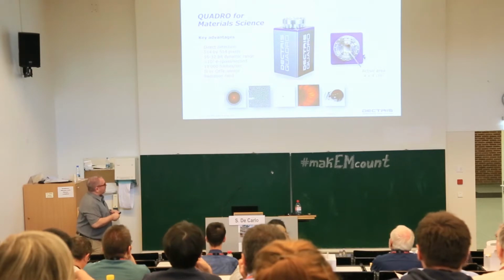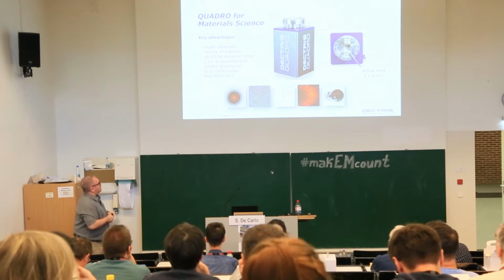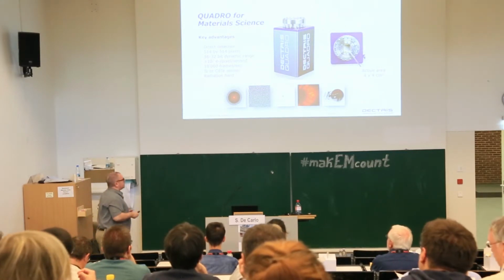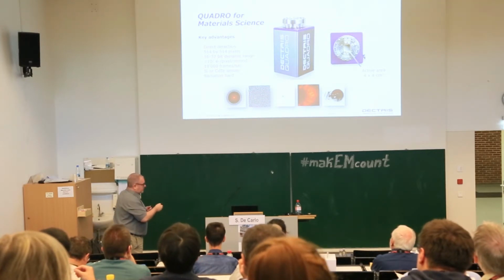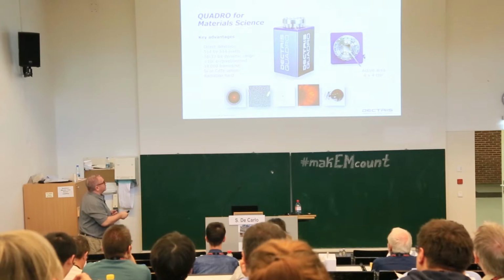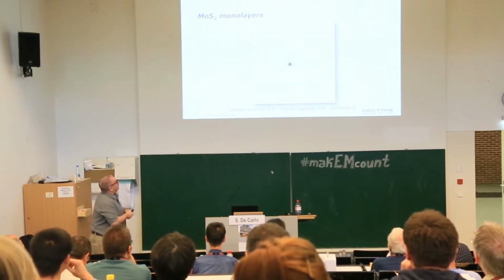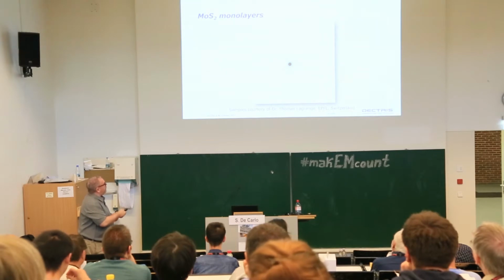Here are just a few examples where you can see that the direct electron beam is actually able to impinge on the sensor without the need of using a beam stop. And this is just atomic images and convergence beam electron diffraction example. So here is just molybdenum disulfide. This is the diffraction image, shown at a slightly bigger magnification. The samples were courtesy of Dr. Thomas Lagrange from EPFL in Switzerland.